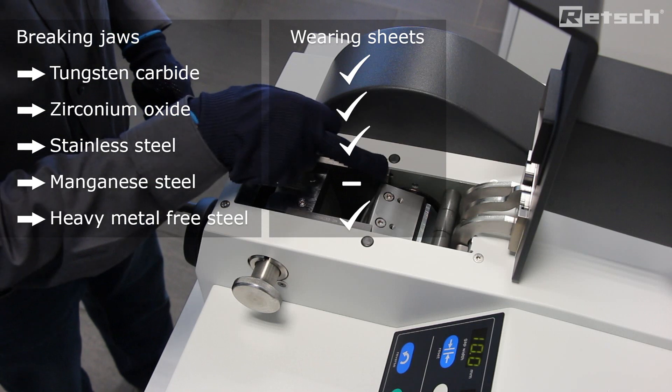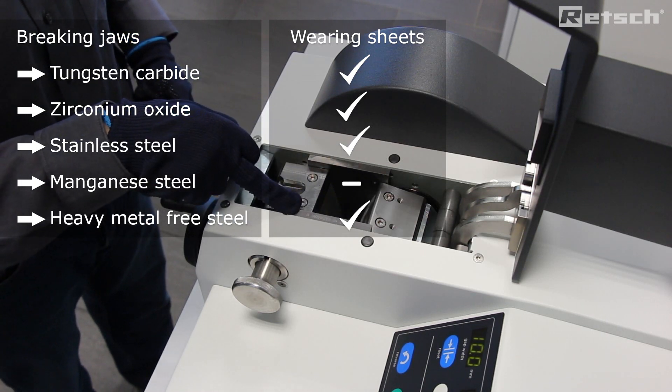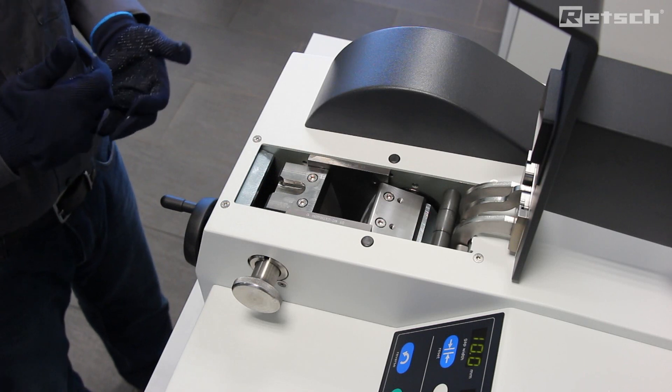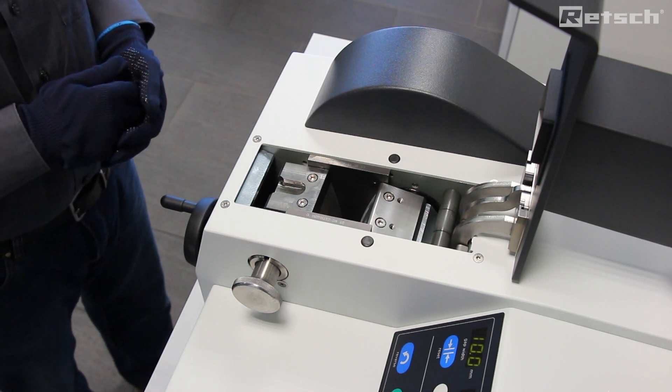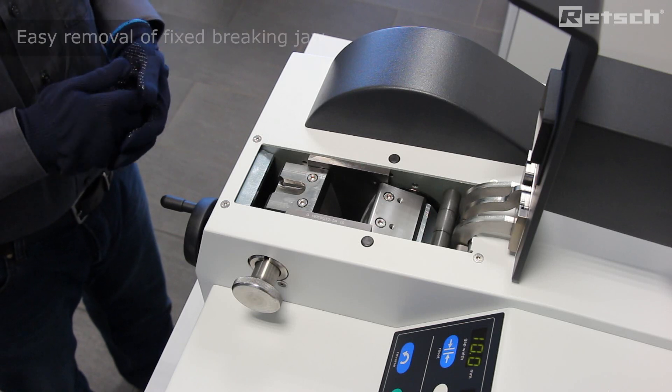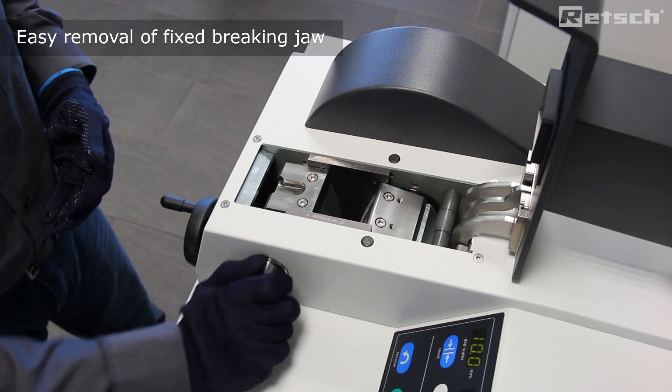We also offer the side wearing sheets in a variety of materials. After the crushing process it is very important to clean the product contact surfaces, therefore removal of the breaking jaw needs to be very easy.